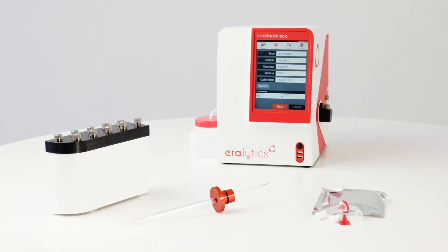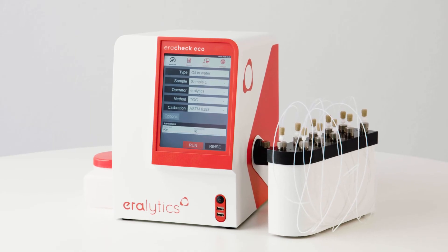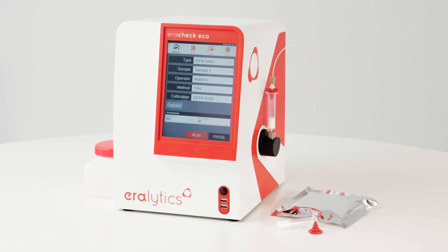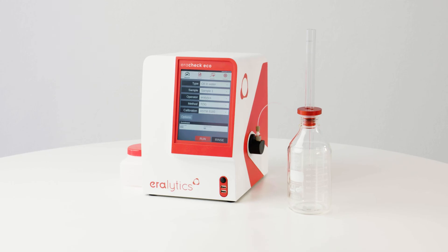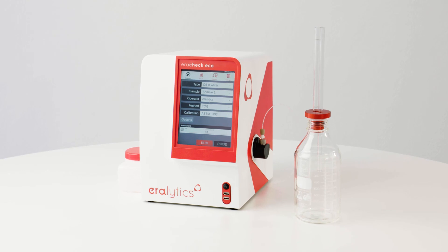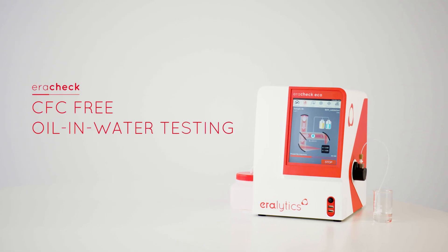Extended measuring options. Eracheck can also be equipped with a 10-position auto-sampler for high sample throughput. Solid phase extraction cartridges are directly attachable to the inlet of the instrument, allowing for easy sample preparation. An optional extractor enables simplified extraction. Eracheck – CFC-free oil-in-water testing.